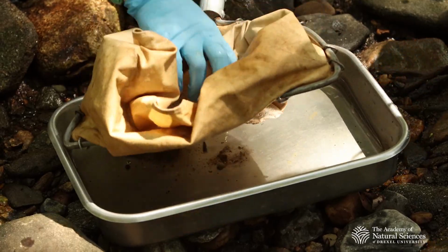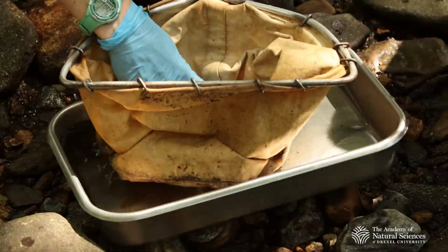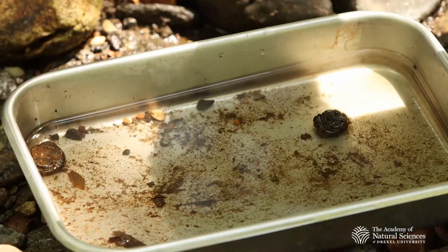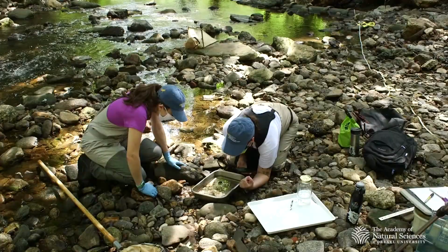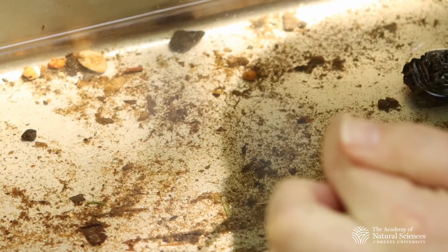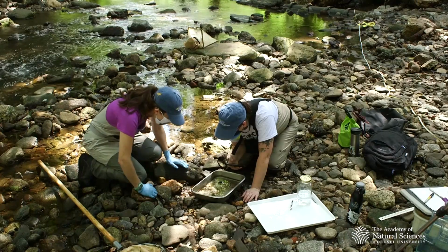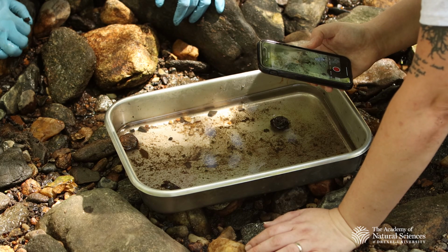Not as easy to do as the Surber, I don't think, so this like firmer material. Thank you. Oh, what's that? Did you see it? Yeah. It's so tiny. Is that it right there? It looks like it's on the surface, but I don't recognize it as like... Well, there it is. Oh, yeah. I think it's a mayfly. Really? It's so tiny. Yeah, they're that tiny now. Oh my gosh. It's so cute. There it goes. Oh, yeah, I think it's a mayfly.